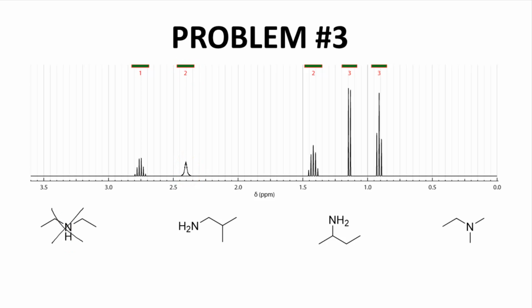And this is why I tend to look at the spectrum and I look for information that's going to be as helpful as possible. Let's take as many compounds or possibilities off the table as quickly as we can.